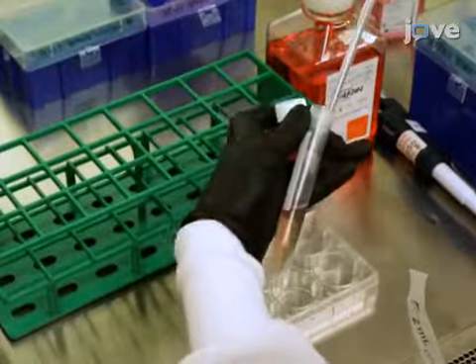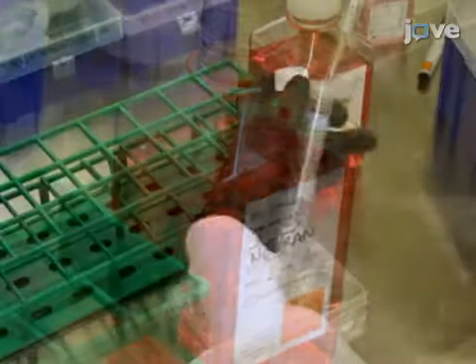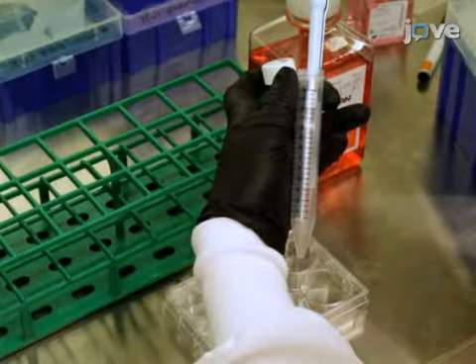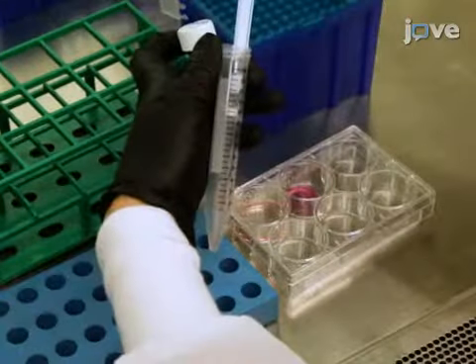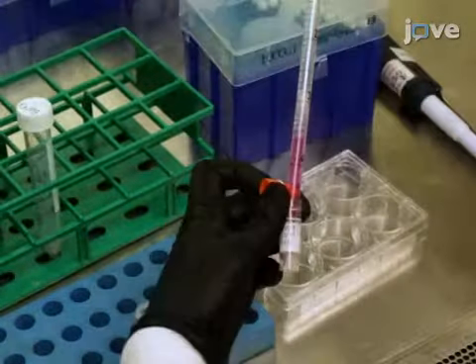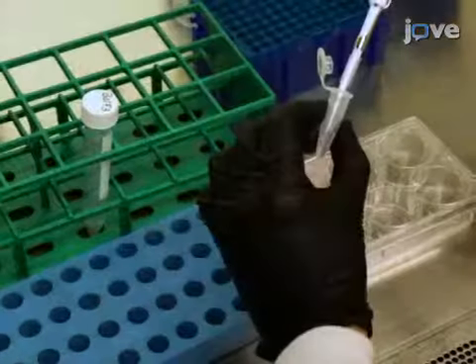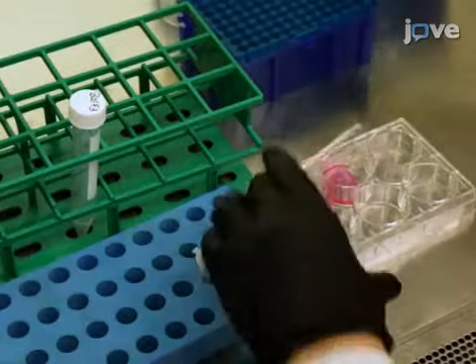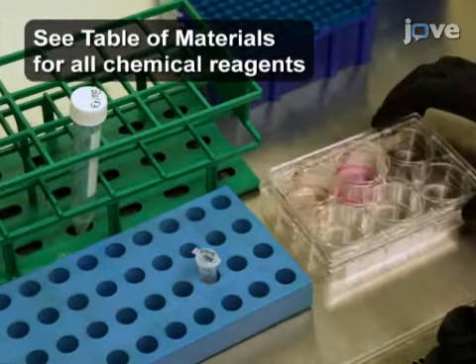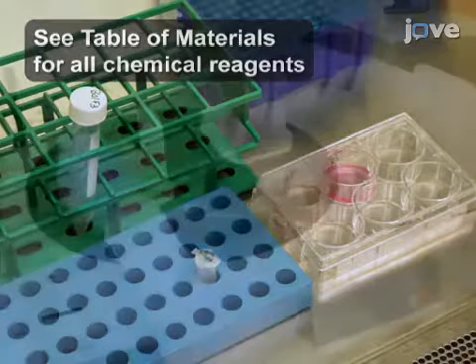Next, aspirate the supernatant and resuspend the BaF3 cells in media by pipetting the cells up and down several times. Add 500 microliters of the resuspended cells, 1.5 milliliters of viral supernatant, 4 microliters of polybrene, and 10 nanograms per milliliter of murine interleukin-3 in a 6-well tissue culture plate.